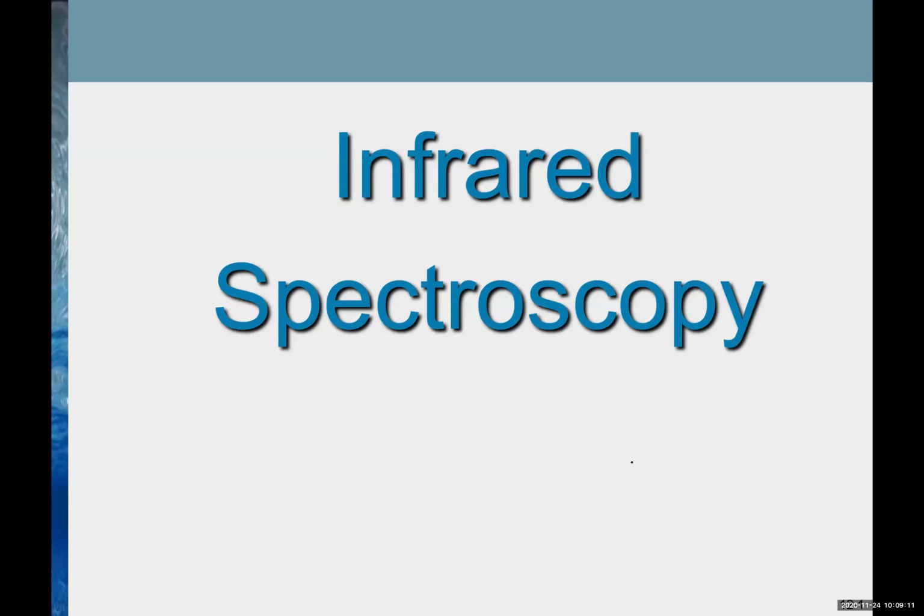So in infrared spectroscopy, we analyze the interactions between matter, which is chemicals or molecules, everything is matter, with infrared rays. Okay, so I'll explain in more detail in a couple of slides later, but that's what infrared spectroscopy is.